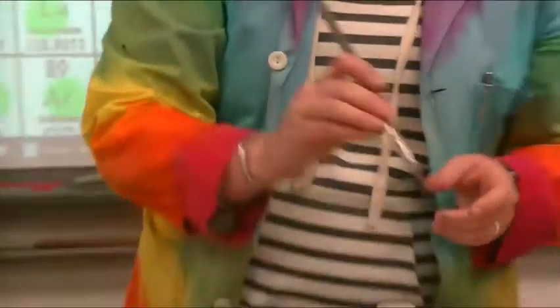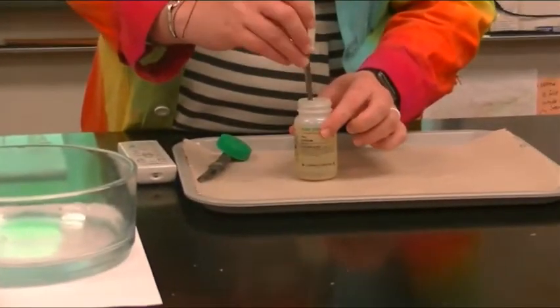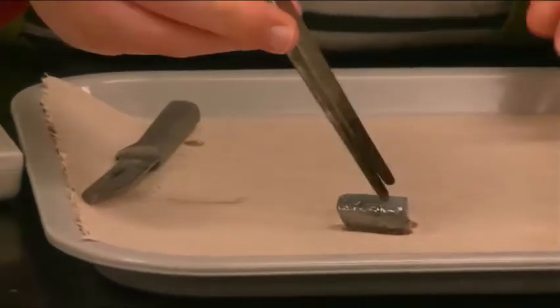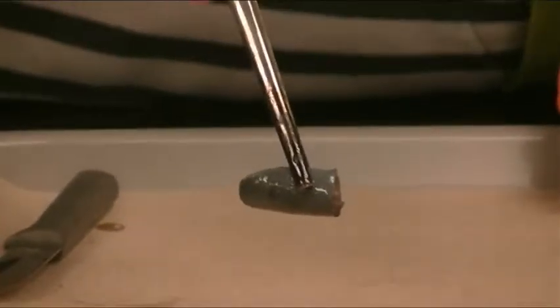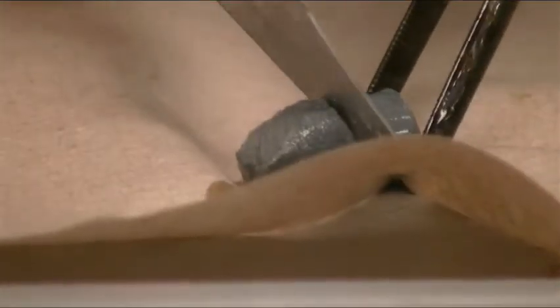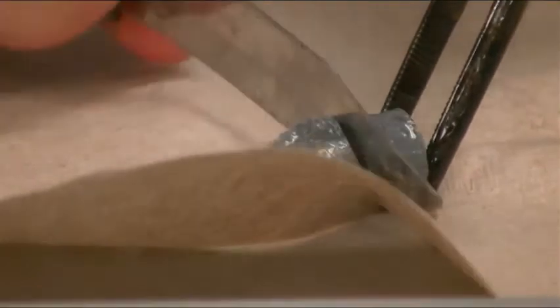So you always will see it in mineral oil. So I'm going to move it down here. One of the things about the metals is that metals are shiny and these ones are particularly soft. So if you can see this metal here, it looks gray like you would expect a metal. It is a little shiny on one side. I can actually just cut this with a knife. This one isn't as soft as the other one.